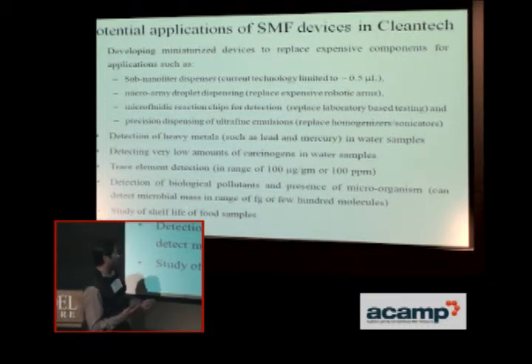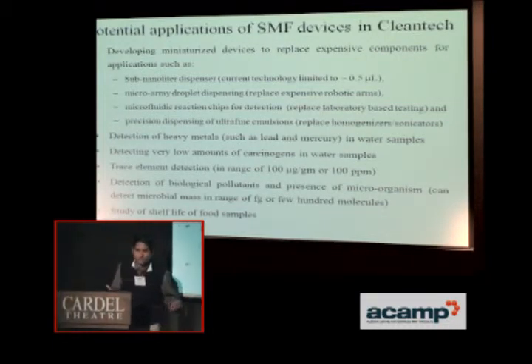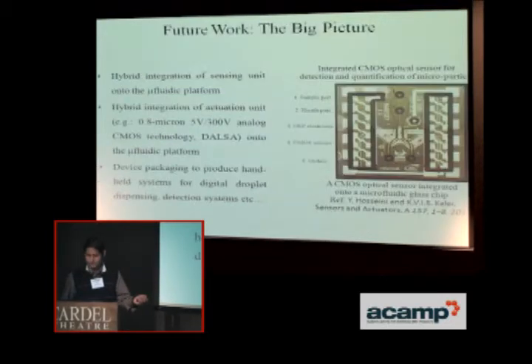And yeah, we can also study the shelf life of food samples because by providing these emulsions, we can create a controlled environment that could be used to study the life cycle of various food grades.